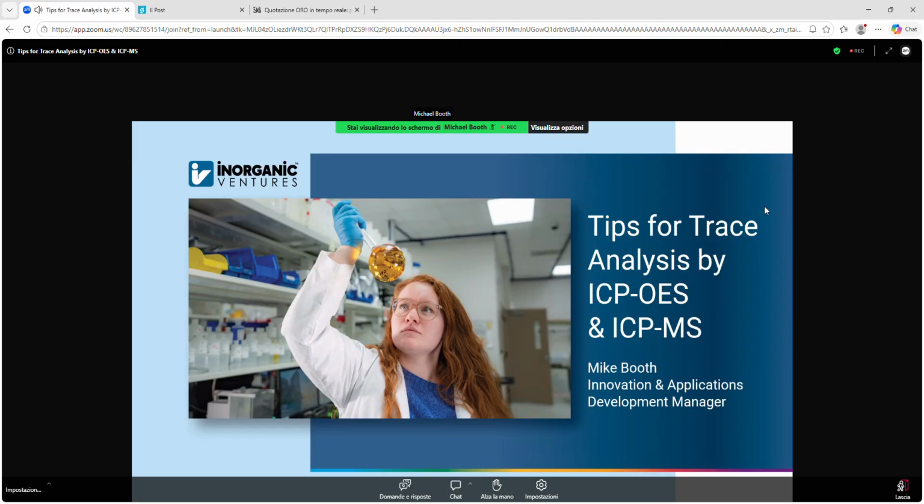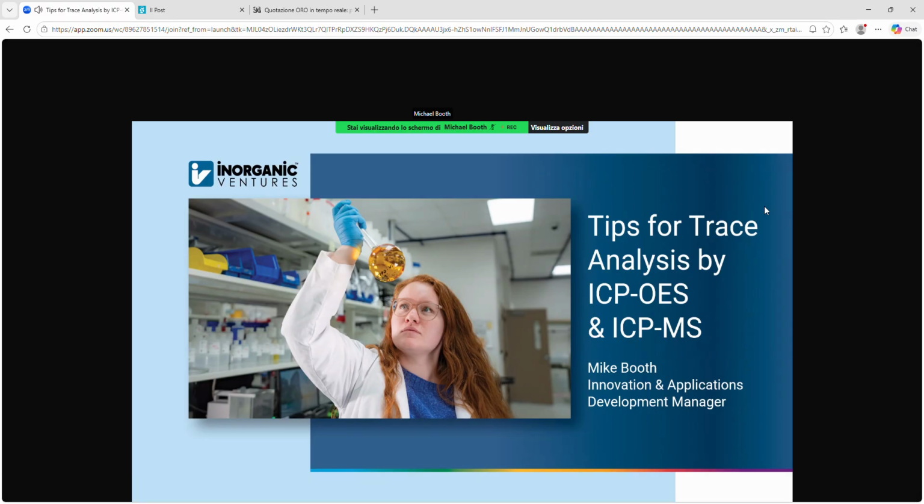I'm going to go ahead and share the presentation. Thomas, just let me know if this isn't working. But I'm going to go ahead and start things off. Like I said, my name is Mike Booth, and today we're going to talk about tips for trace analysis by ICP OES and ICP Mass Spec. I am the Innovation and Applications Development Manager here at Inorganic Ventures, which is just a fancy way of saying research and development. So my team handles new products and also our custom products.